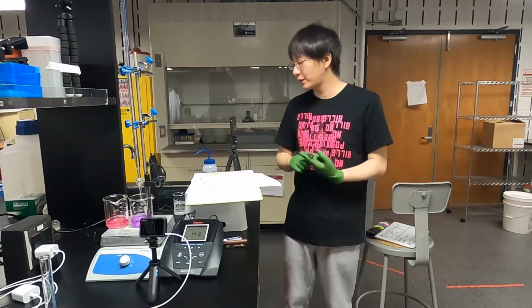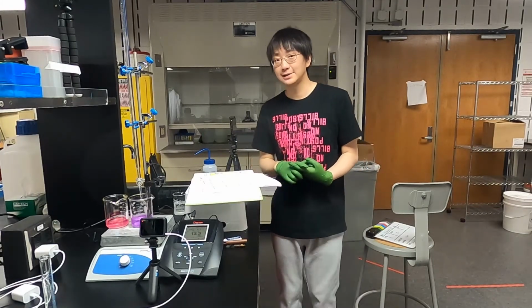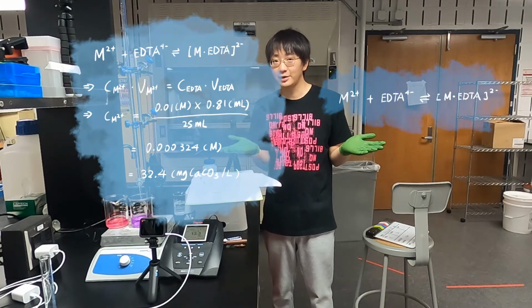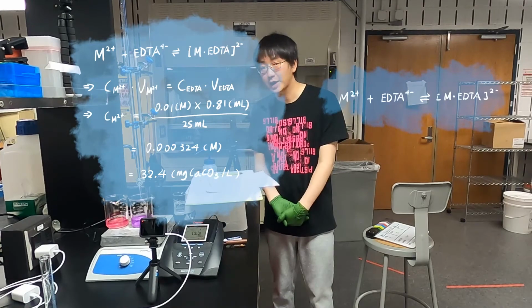So now we have the data of the volume for calcium hardness, and also recall that we have the equation here, and then we can do the calculation. We can calculate the calcium hardness in the solution.